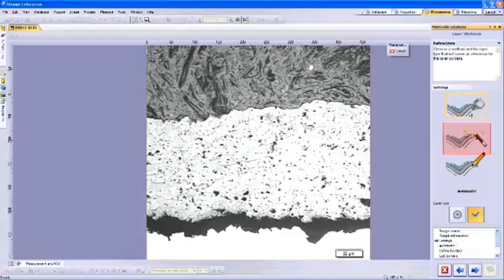Magic Wand still utilizes a threshold evaluation of the layer, but will allow you to manually adjust the amount of threshold that is applied to where the selection is made. Manual Definition allows you to manually place the points to define the contours for the selected layer. This is useful when you do not have enough threshold or contrast difference between the layer and the background. Select Automatic for this demonstration, as the sample image does have a contrast difference between the layer and the background.